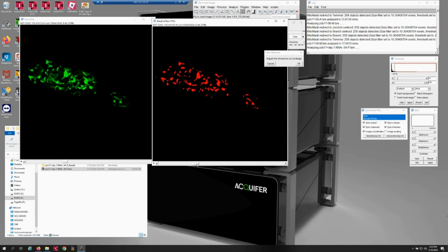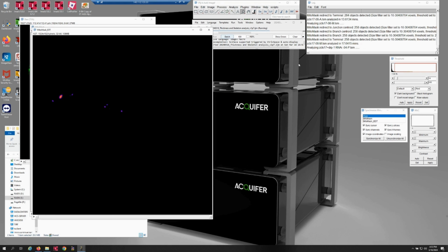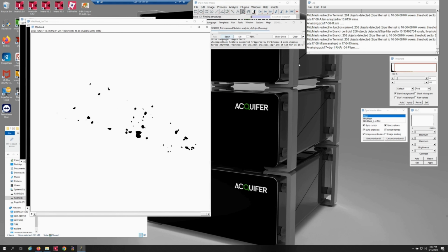So, let's also adjust the z-axis a bit, and then align the images on both sides. They actually look pretty consistent. Once they're quite consistent, you can press OK. After that, it will take a little time to perform the analysis. Once the analysis is finished, it will soon close all the view windows. And then I'll pause it.